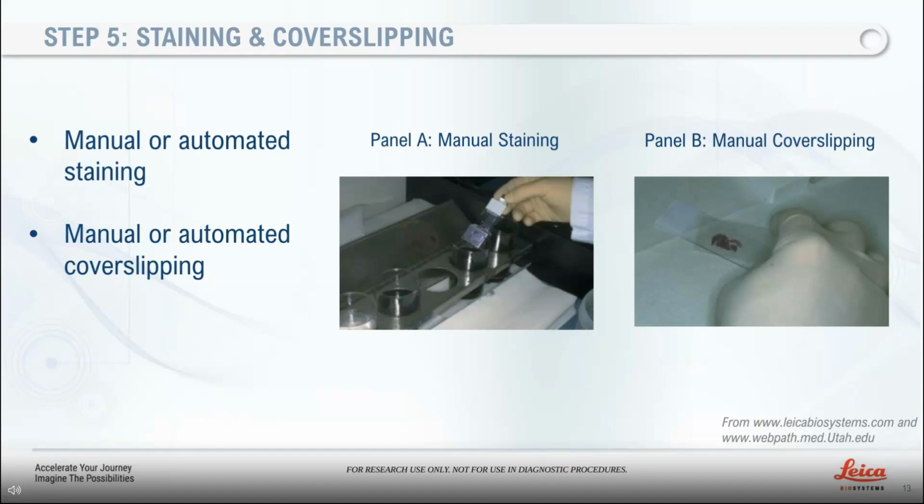Some labs work strictly with hematoxylin and eosin stains, whereas others can use a wide variety of immunohistochemistry and in situ hybridization labels. Some labs will specialize in electron microscopy. There are certainly a variety of imaging needs, techniques, and combinations available. These protocols may be done manually, which will require much more time and effort, or become automated, which will help the staff, but more importantly, research, as it has the potential to decrease variability in results.